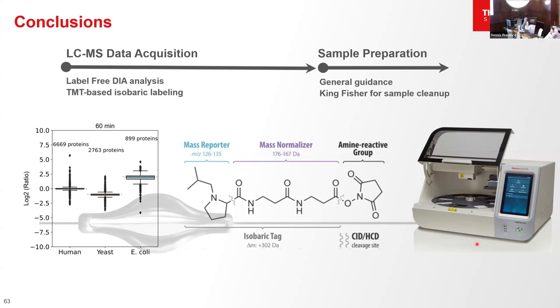Okay, thank you. I'll add to that too, that I come to this fight as a mass spectrometrist, so I'm going to err on that side. You can look at the raw mass spectrometry data, and it gives you some confidence in the call that's made.